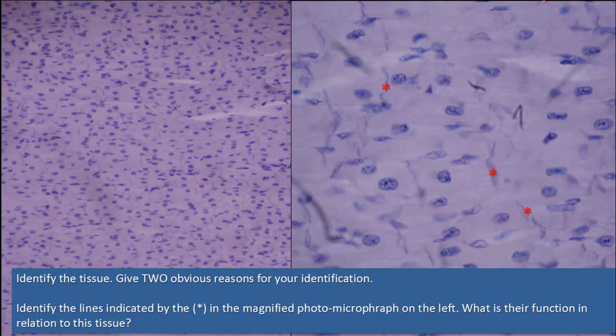Identify the tissue, give two obvious reasons for your identification, and identify the lines indicated by the asterisk. What is their function in relation to this tissue?